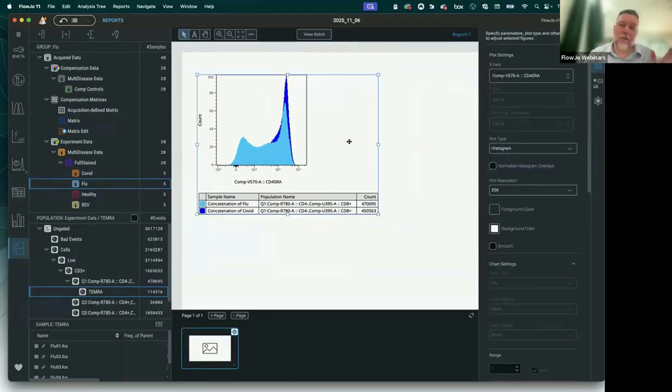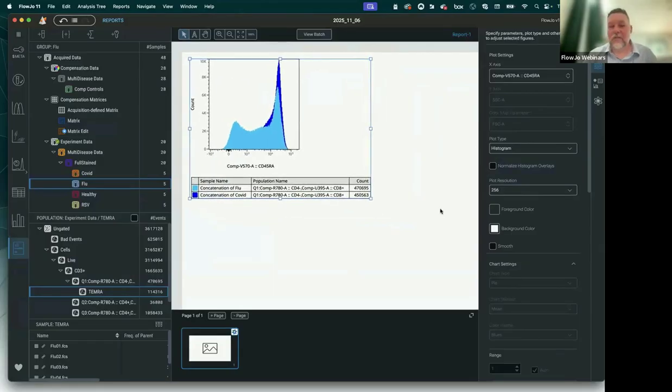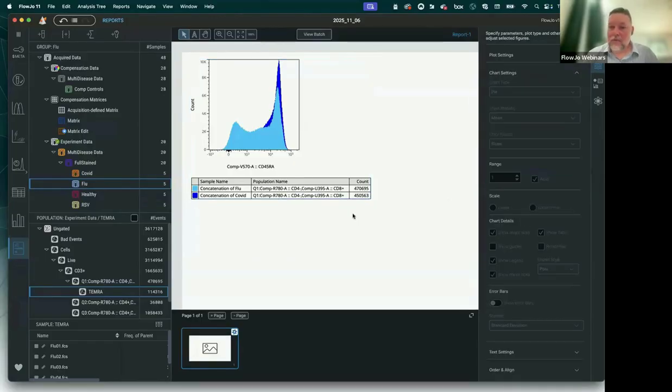Oh, I'm sorry. I'm looking for it in right click because I'm such a diehard old version user when I should be toggling it on. So normalize is a checkbox. It's not a right click option. It's under the histogram. It'll become available once the plot type is. Again, very new. This is fresh off the shelf. It is available as of last night on the website, so that option wasn't even in existence. But I hope you like what you've seen so far.